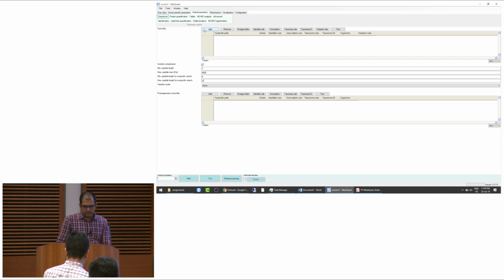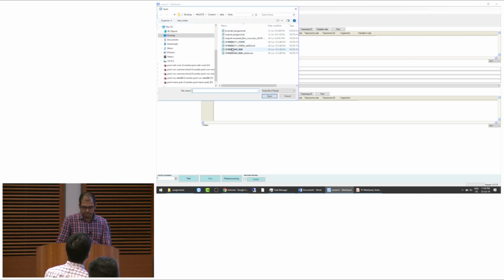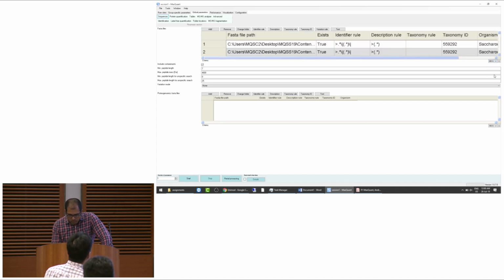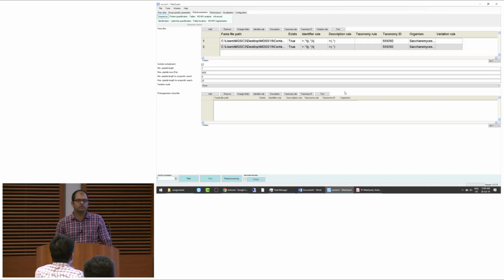Okay, so we add sequences. Is that okay?